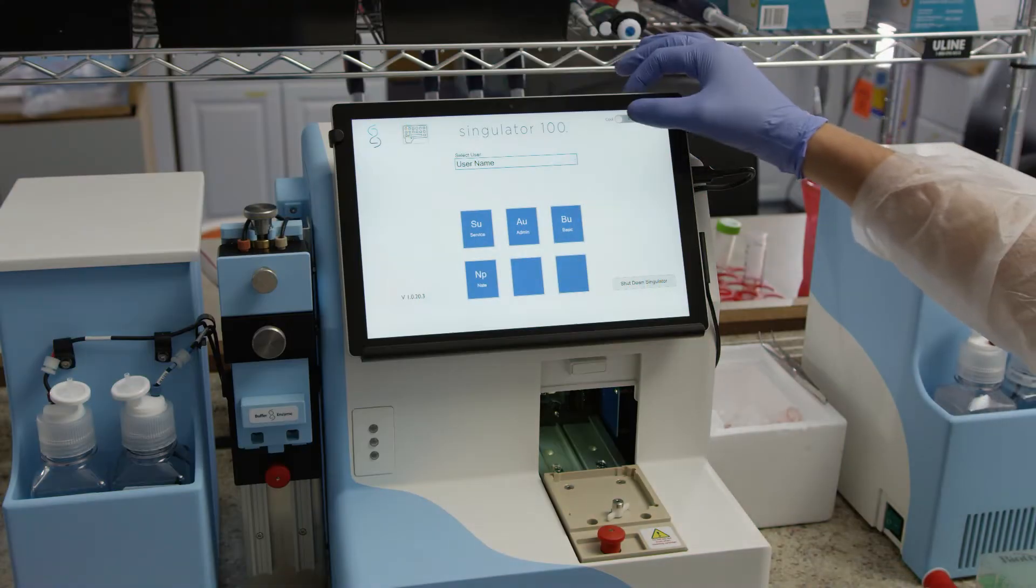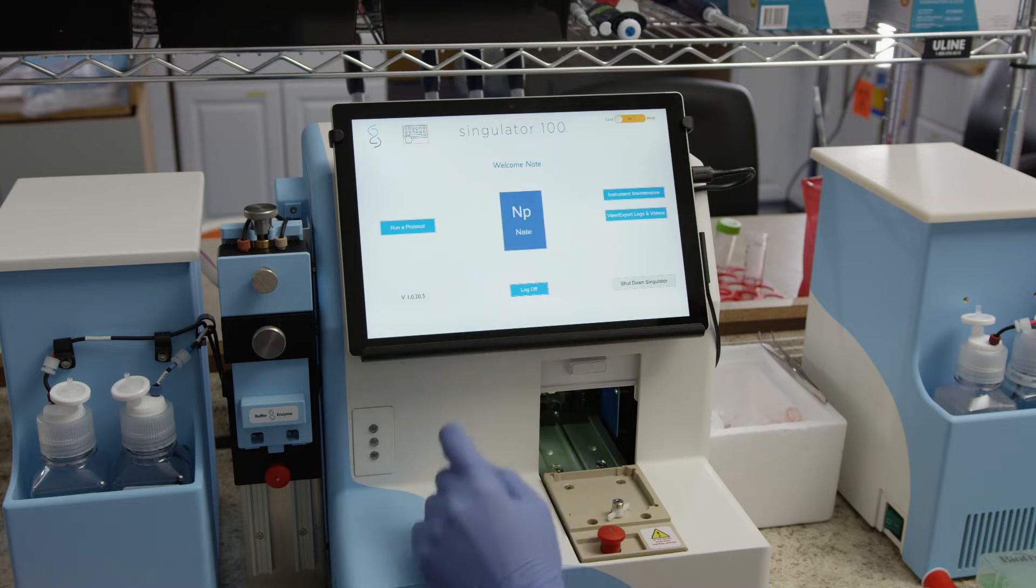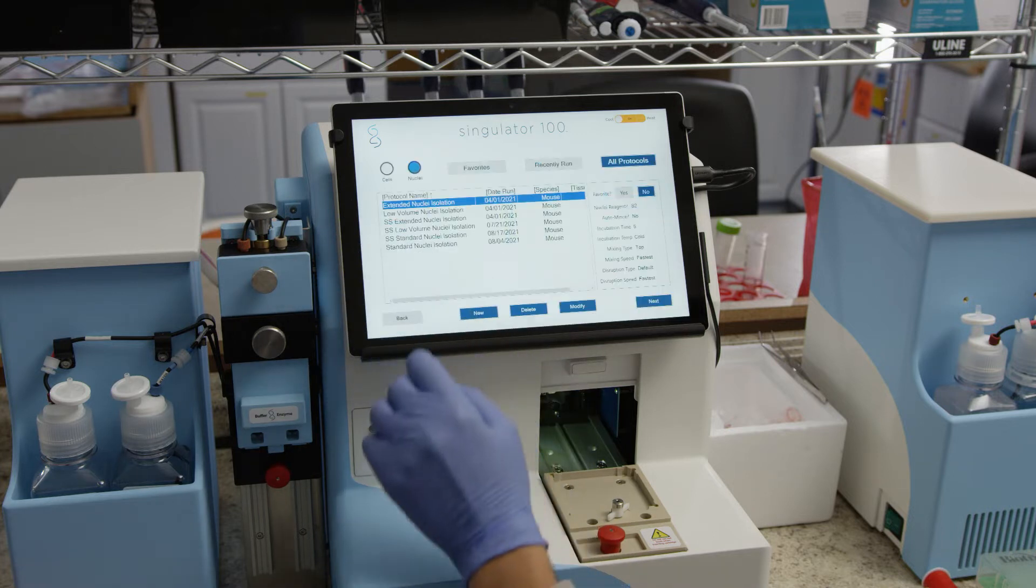Log in to the Singulator software as an admin or basic user, or use your personalized user ID and password. Select Run a protocol.